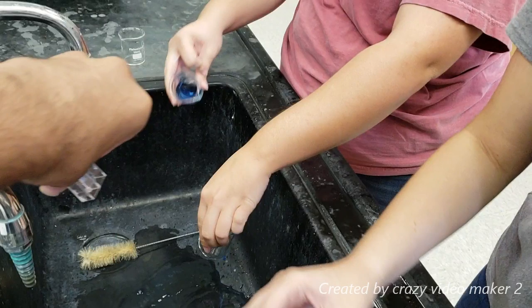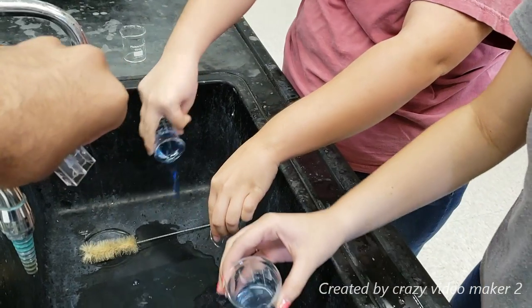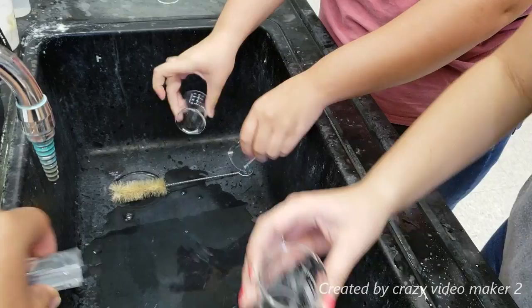Remember to dispose of everything accordingly, clean your lab station, and wash all the instruments.